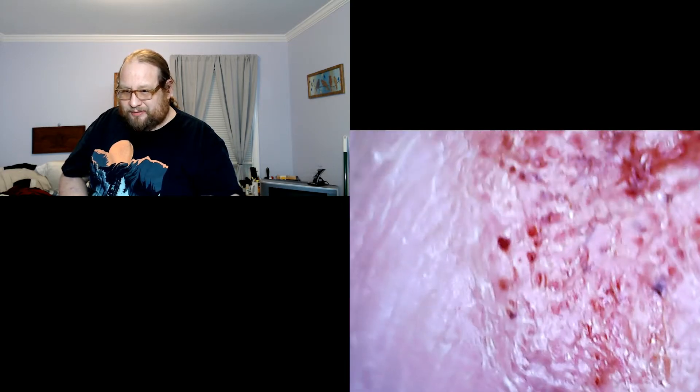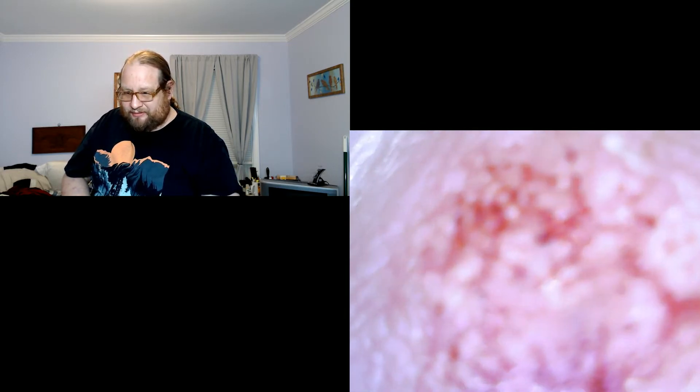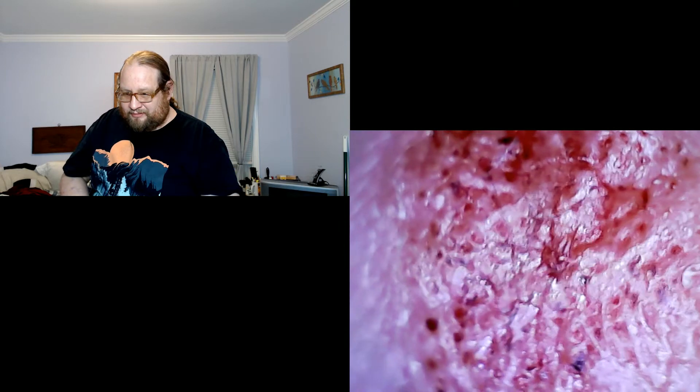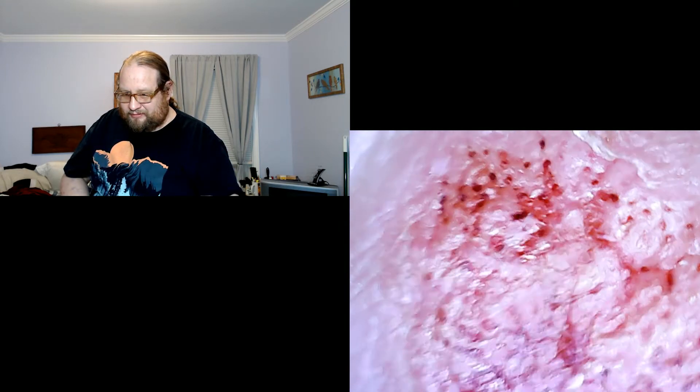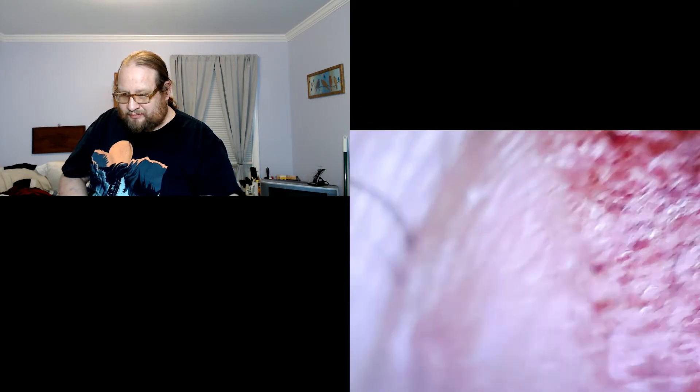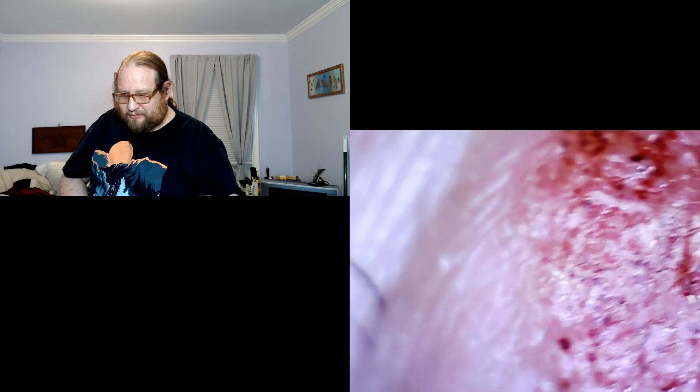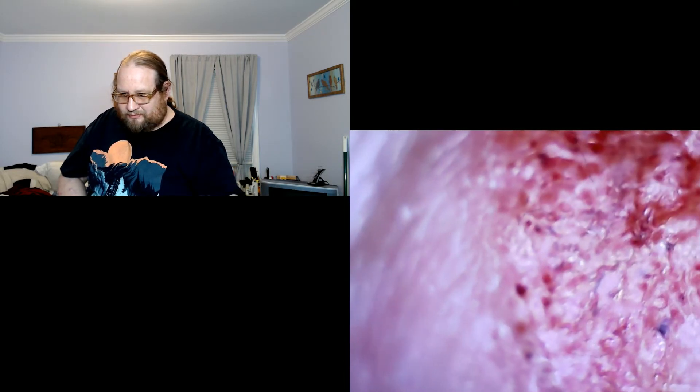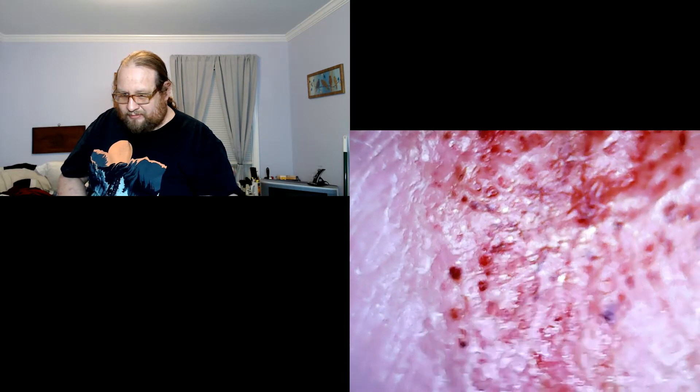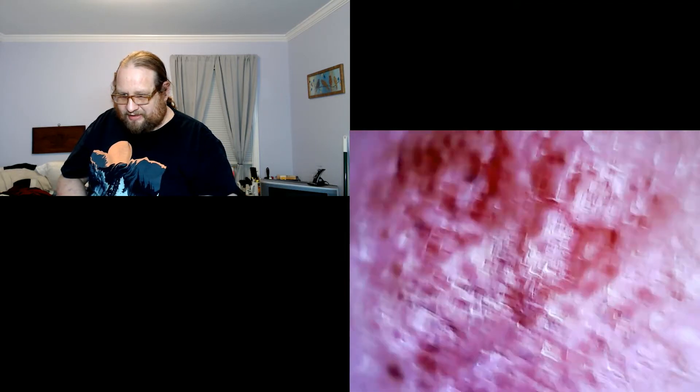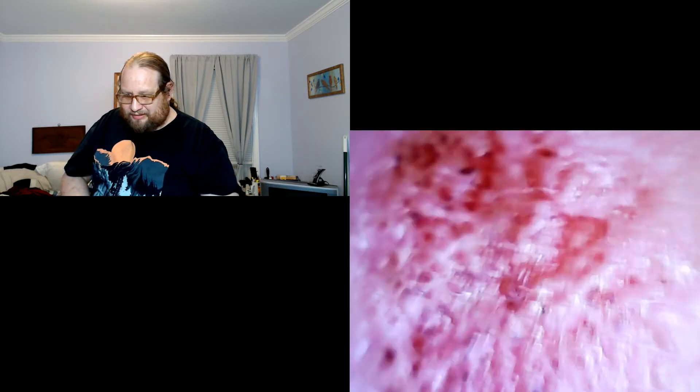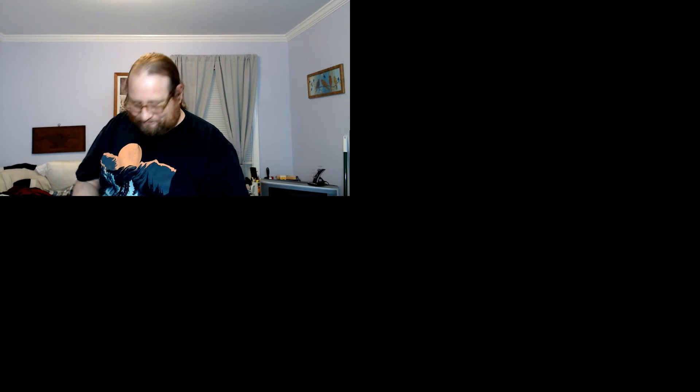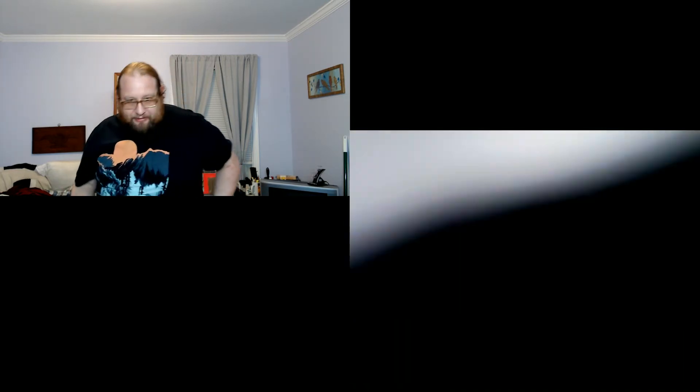I see some black specks but I don't really see any fibers in there. That may be one, I'm not sold. However, let's try something else - these on my hip.